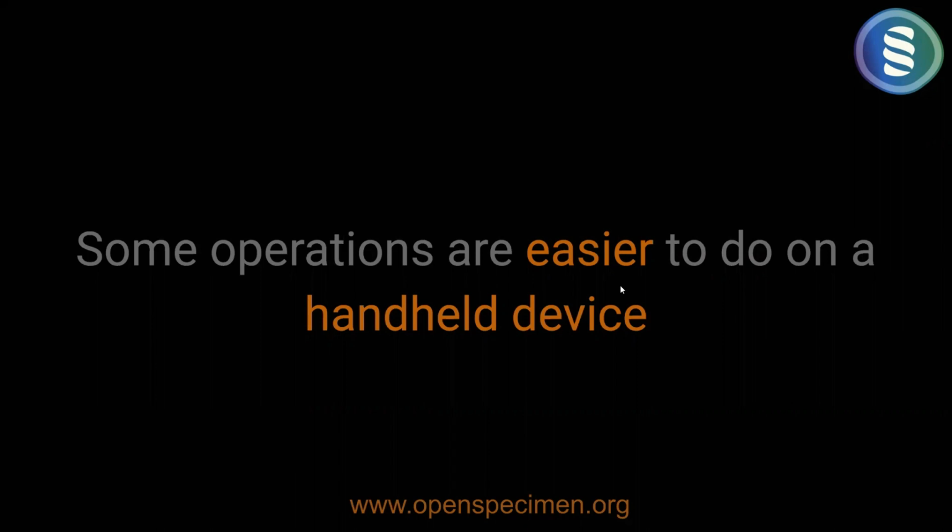In fact, a tablet is much better than a phone because it has a slightly larger screen. Or if you're a lab user standing in front of a freezer, you take out a specimen or a box, and you should be able to quickly scan it and look at the contents of the box or the details of the specimens. So some operations are better done on a handheld device, and some are better done on a laptop. We'll look at some of these.